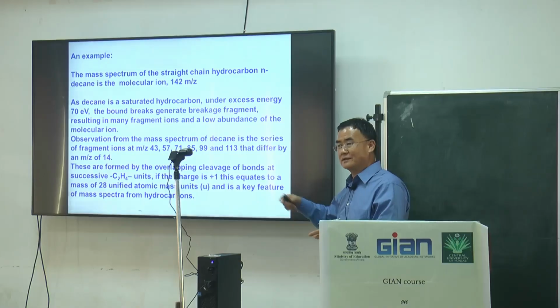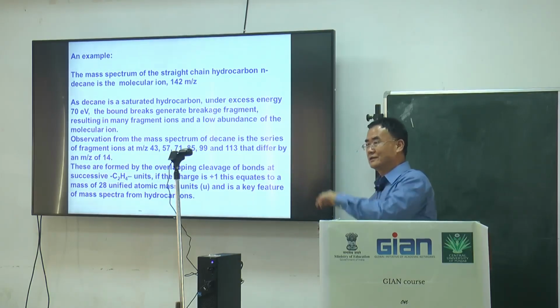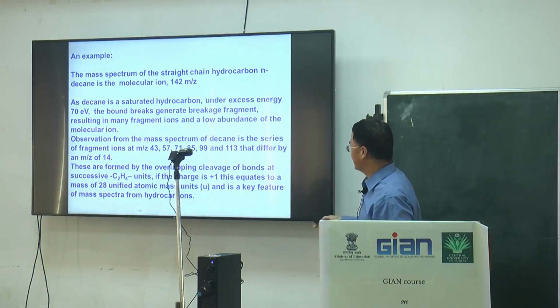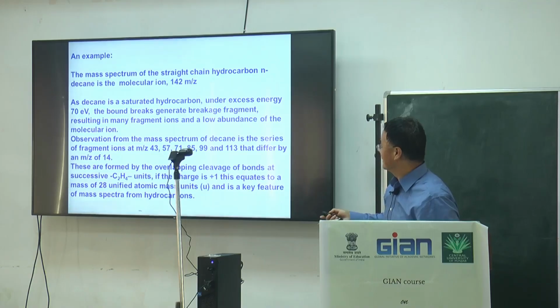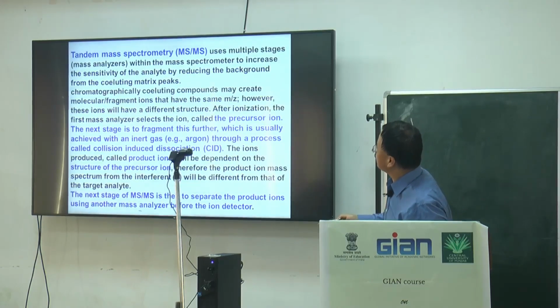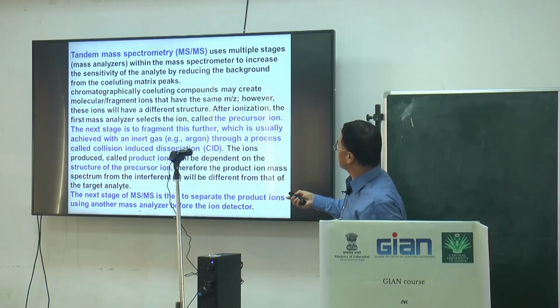Yeah, we can understand from the different mass ion peaks. We know that we can make a prediction of the structure.